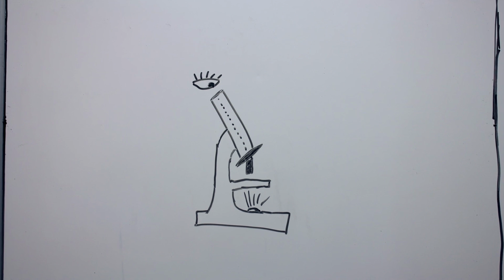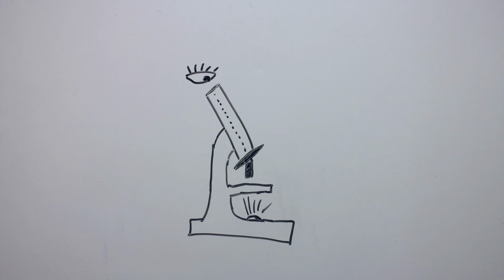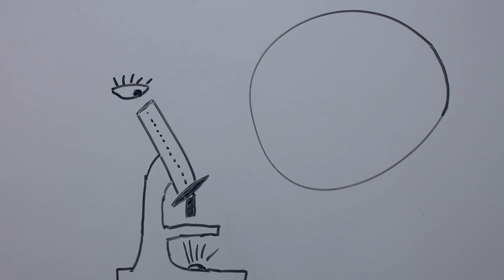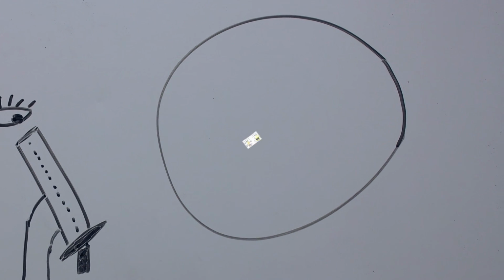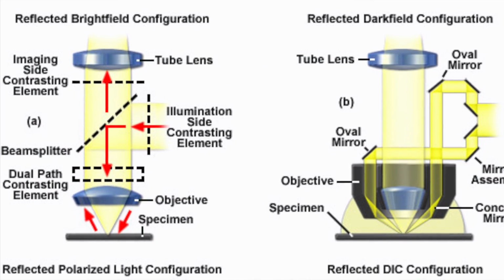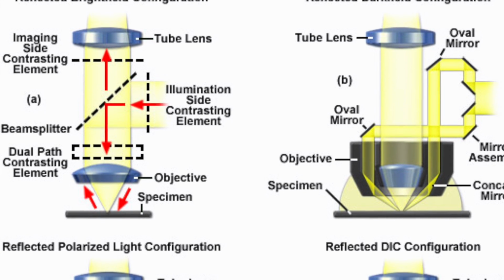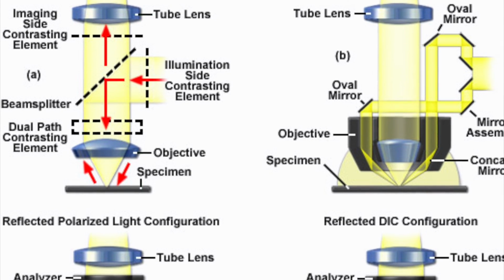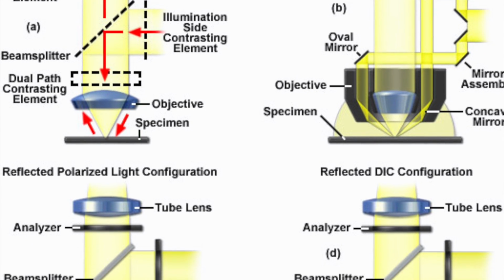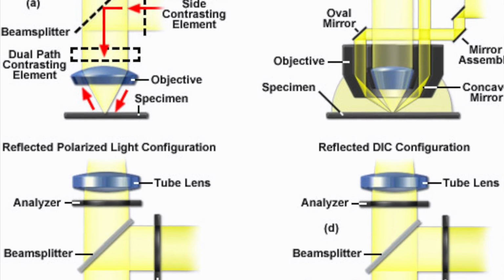Optical microscopes, often referred to as light microscopes, essentially utilize ray optics to enlarge images of small sample sizes in order to observe the fine details of a microstructure. This method uses lights and lenses to reveal light patterns through a sample material, which is then examined to find changes in light intensity and different transmission or reflected angles of light to distinguish the characteristics that the material holds. As useful as optical microscopes are, they can only see down to a resolution of 1 micrometer.